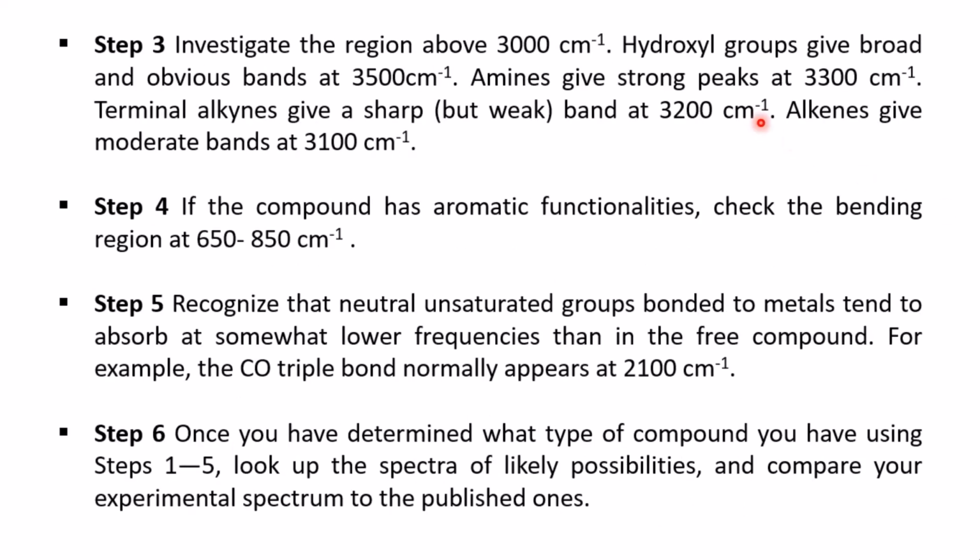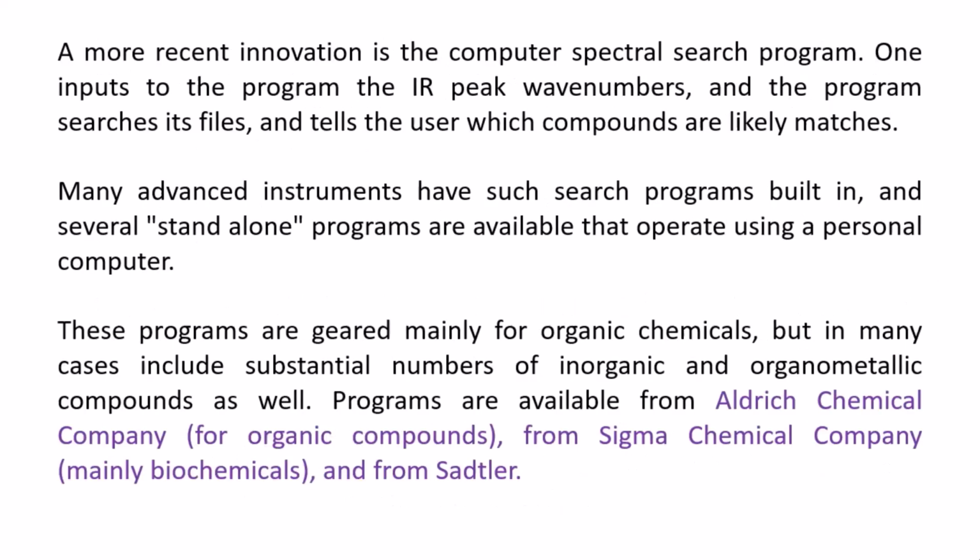There's also the hydroxyl group. And then of course the amine groups, the alkene groups, and all these have certain wave number peaks that you always need to look out for. So the moment you learn to identify these peaks at specific wave numbers, it helps you to know the possible functional groups that are present in the organic compound you are analyzing.